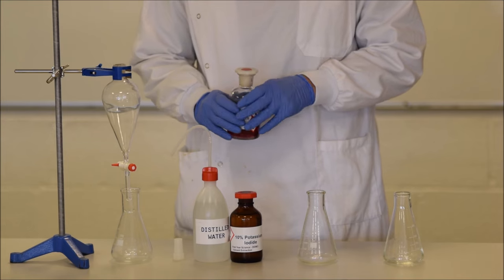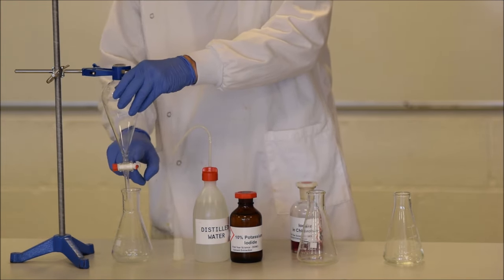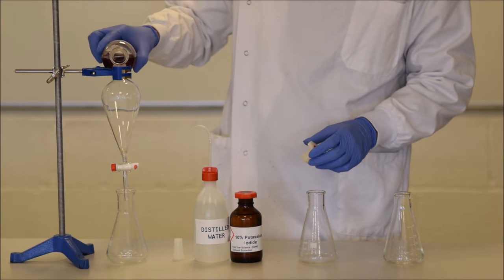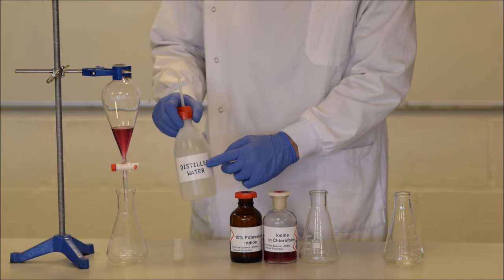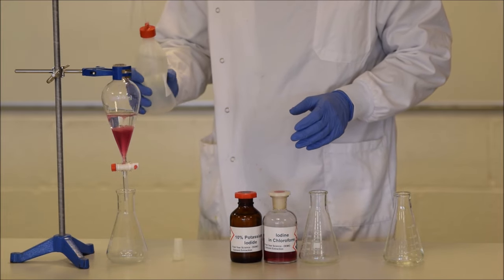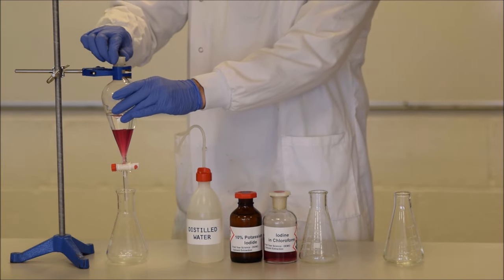You have to make sure though that the funnel is closed before you start pouring anything into it. And you do that by showing that the arm of the stopcock is at 90 degrees to the spout. You can also see the hole going through if you look carefully when you have it in front of you. So now I can put in my chloroform. I put in my chloroform and then I'm going to put in the water. And of course, water floats on chloroform because chloroform is heavier than water.